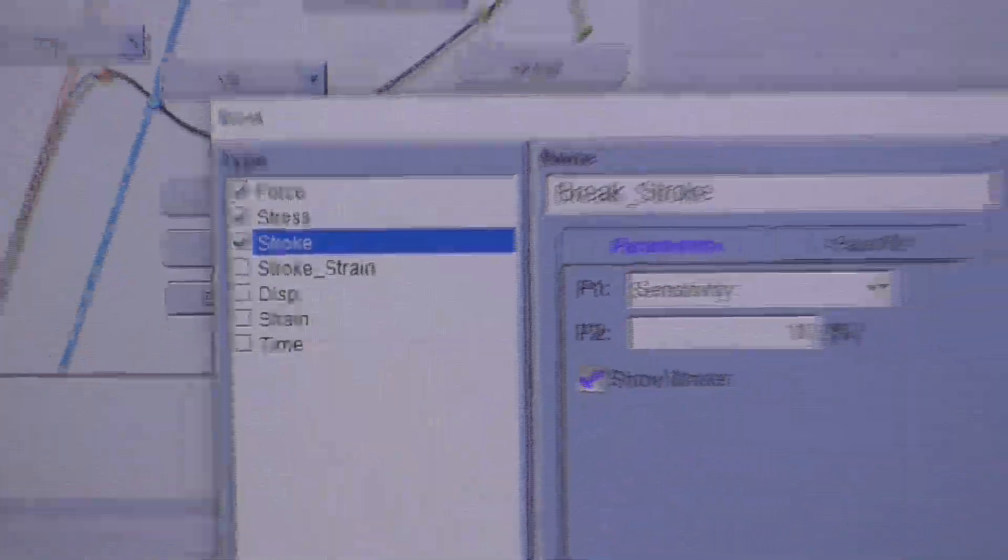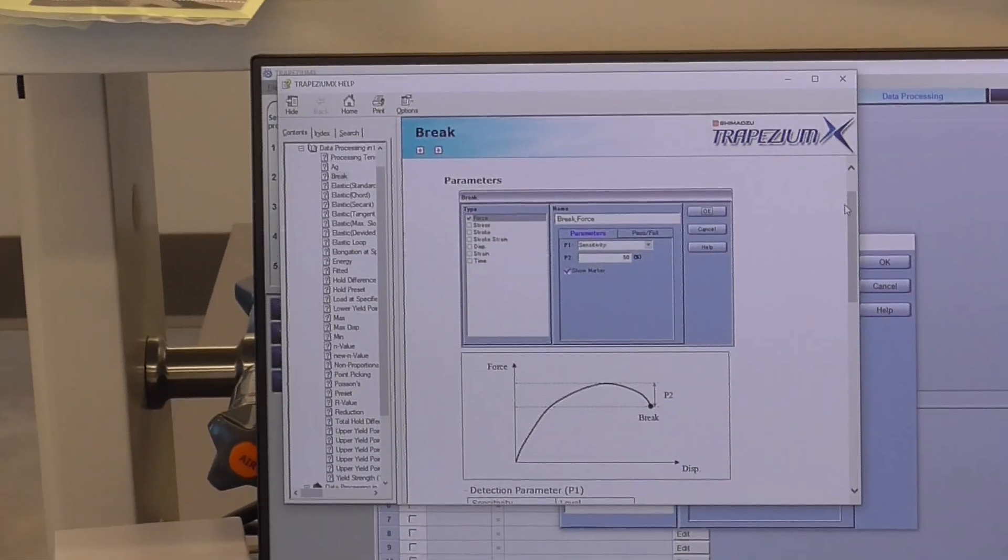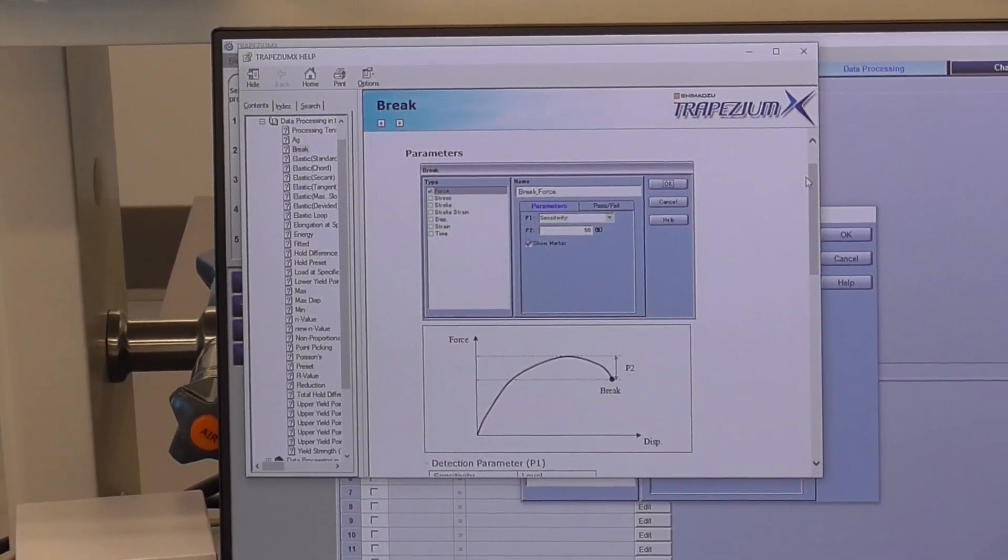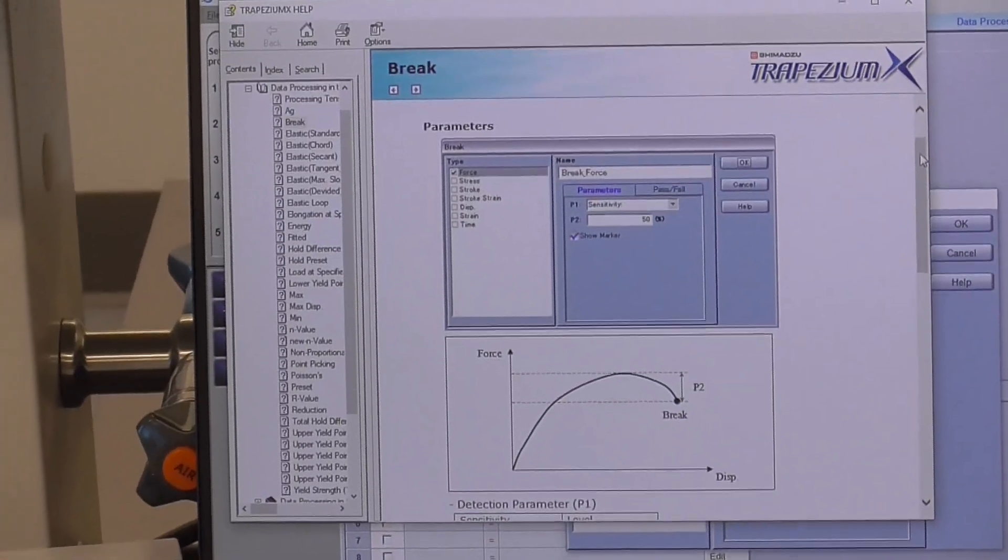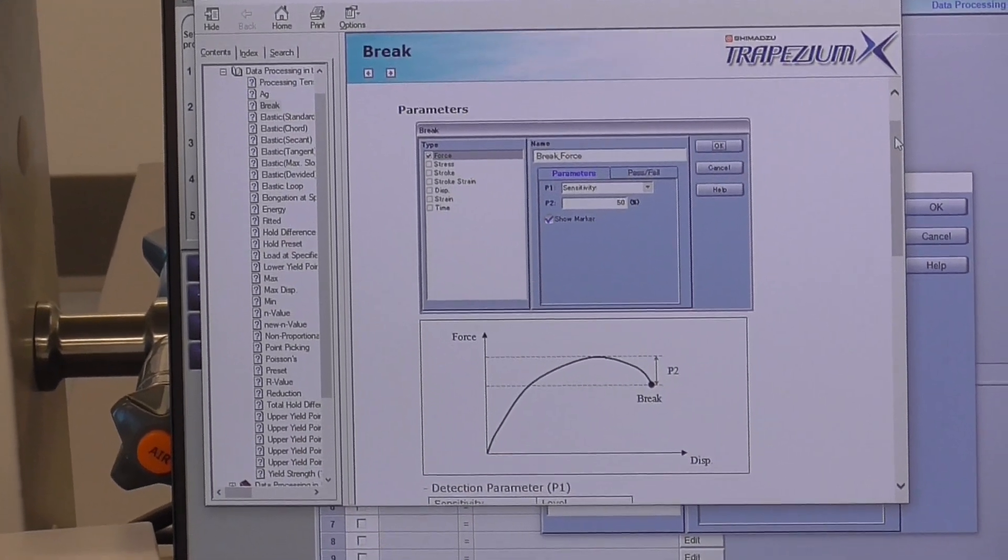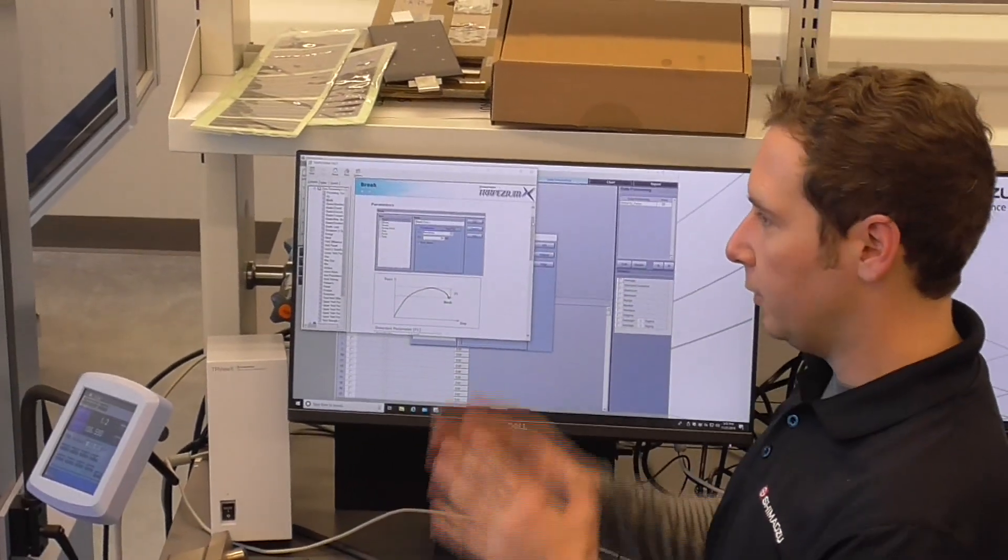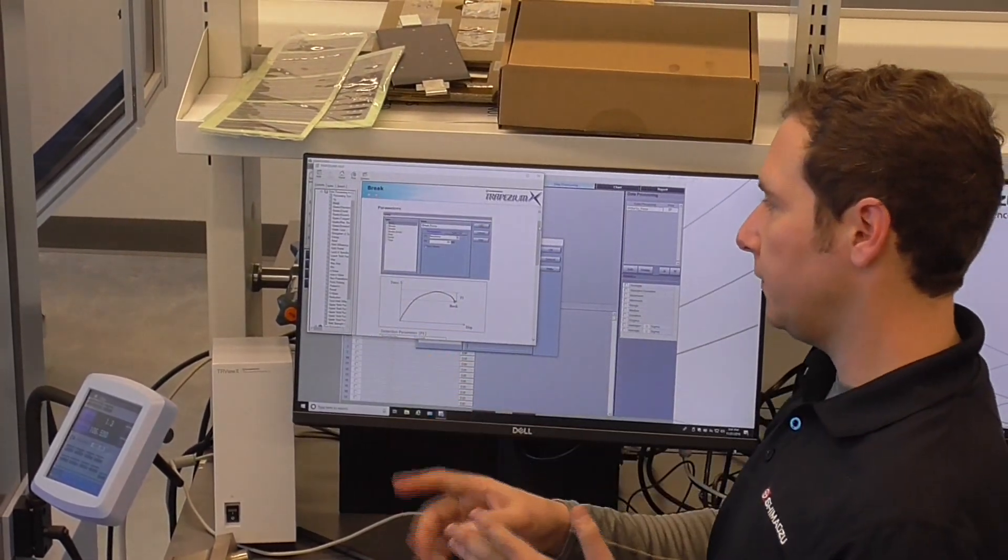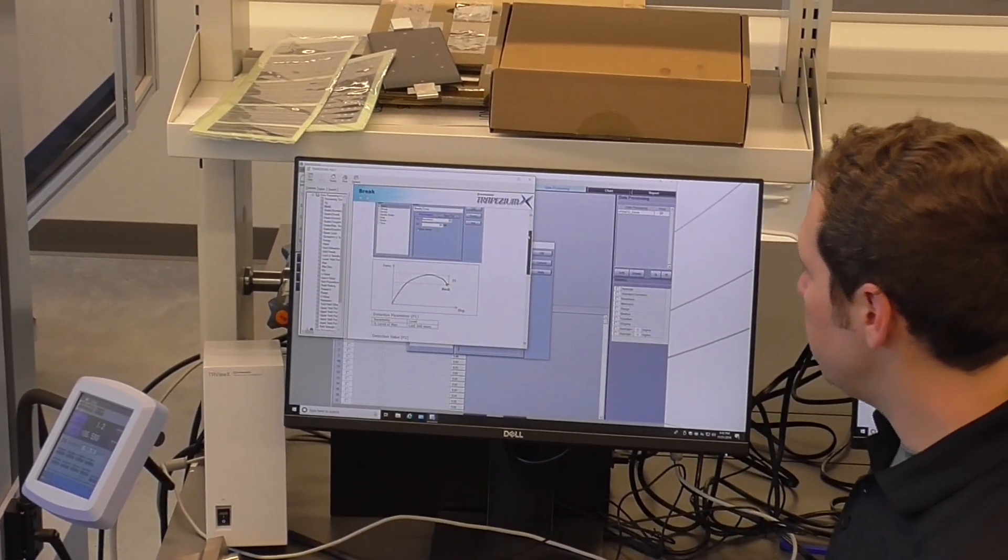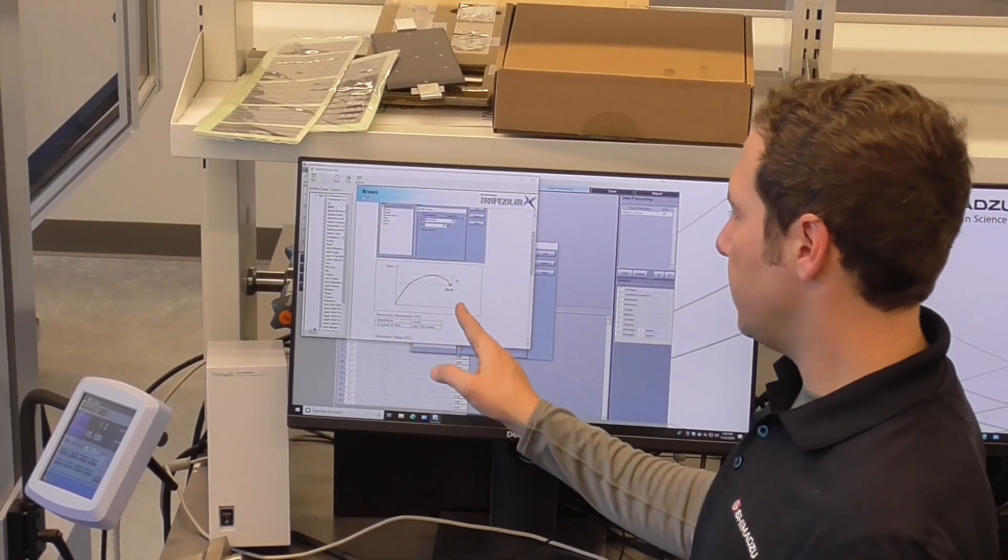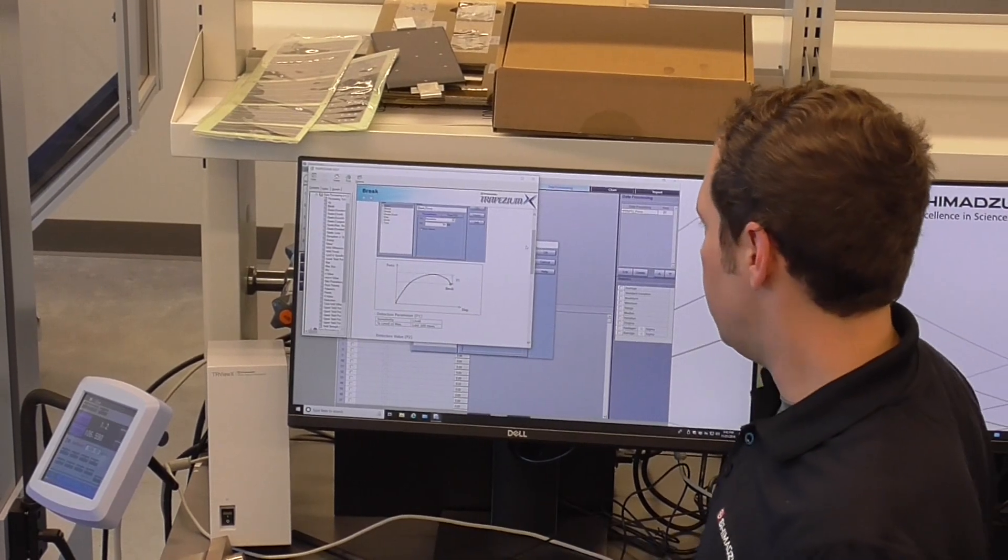So when in this window at any time, like I said, you can click the help and it will take you to the help menu for that certain data processing parameter. And now this is handy, I feel, because in material science there is different nomenclature for different values you're trying to get. And it also tells you how the computer itself calculates these certain values, because how you would look at the graph and kind of calculate yourself, how the computer calculates it, it might be slightly different. So for instance, the way it detects the break, like we were talking about, the drop in that 10% from full scale, and so on and so forth.